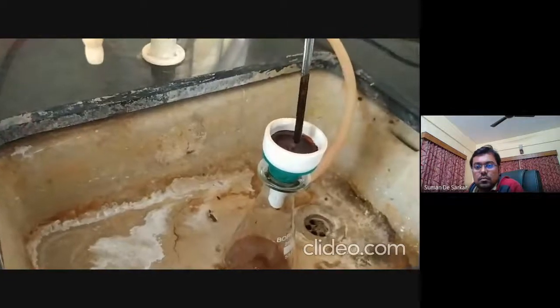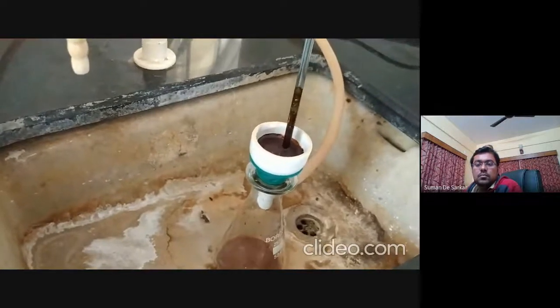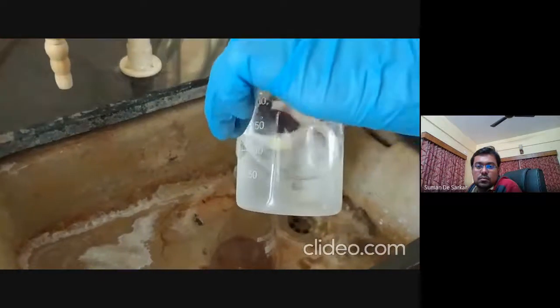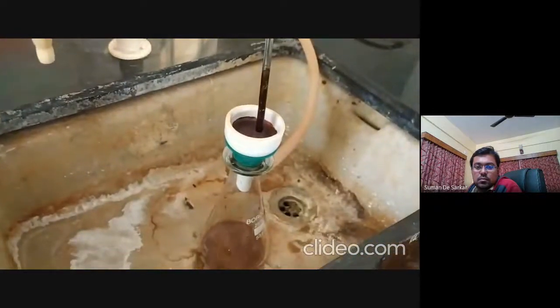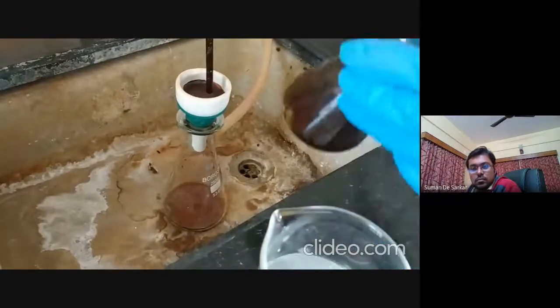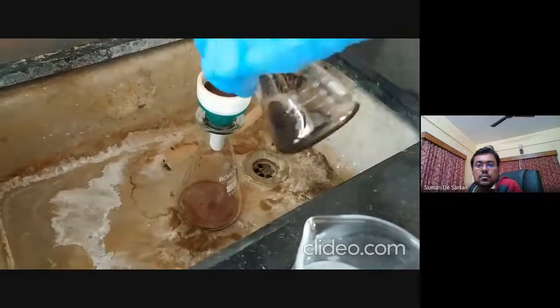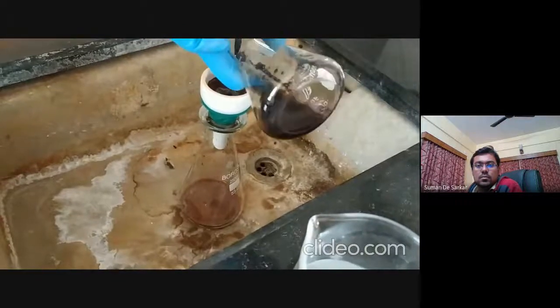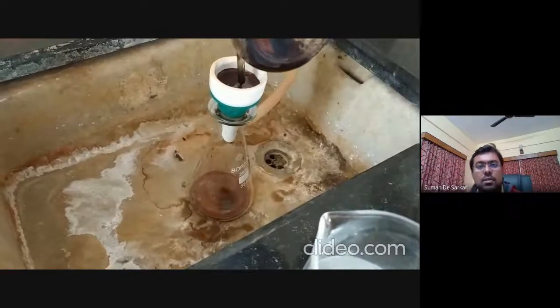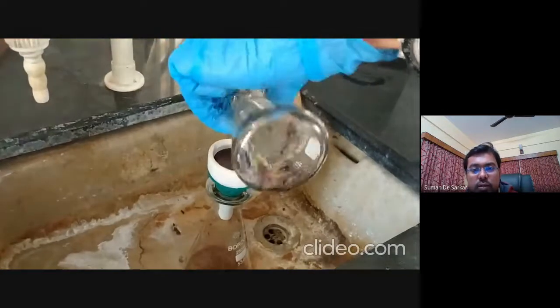We will wash this with cold water. It's so concentrated that it looks a bit blackish, but as I said, the diluted thing will be a nice blue indigo color.